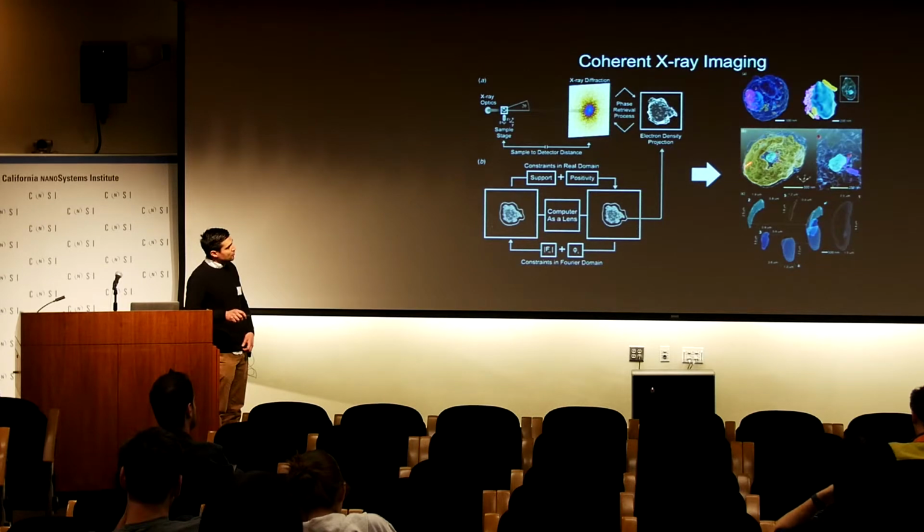These are some examples of this type of approach, trying to render subcellular structures in 3D. So this is a yeast spore where you can see, for example, the nucleolus here, and you can see some associated structures with the cell.